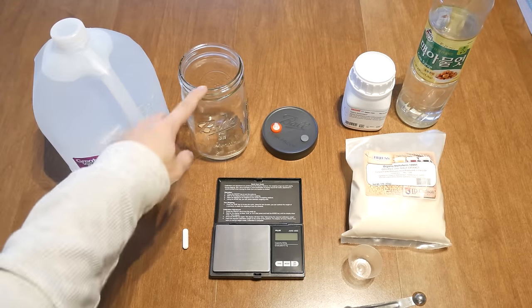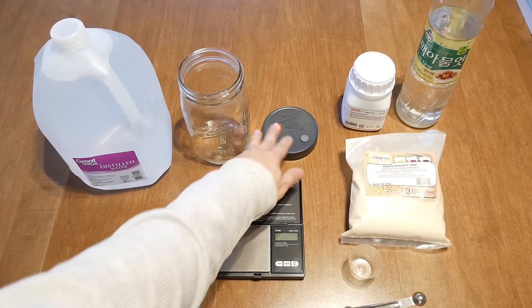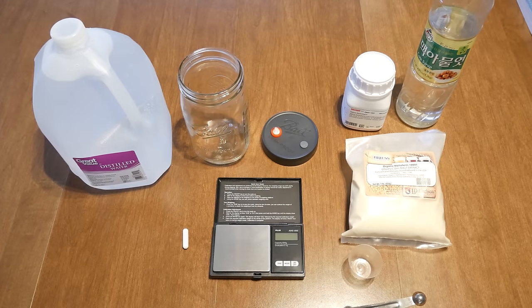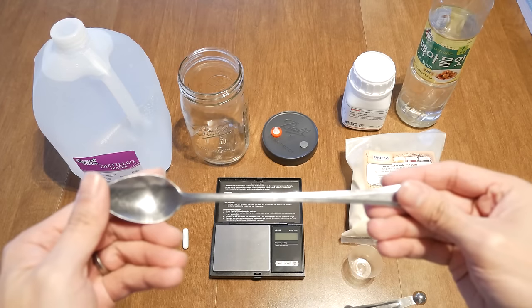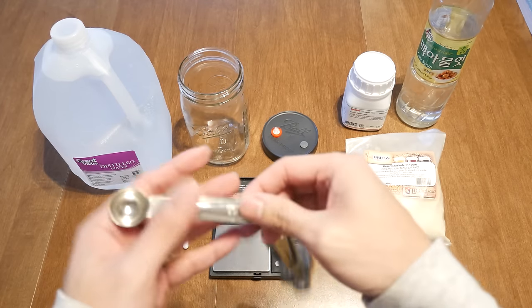Today I'm using distilled water — you can use filtered water, that's fine. You'll need a quart mason jar, a liquid culture lid, a spoon to mix the ingredients together, a measuring spoon to weigh out the ingredients, and a magnetic stir bar.